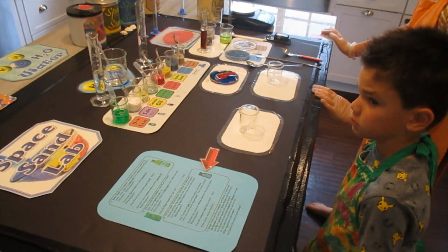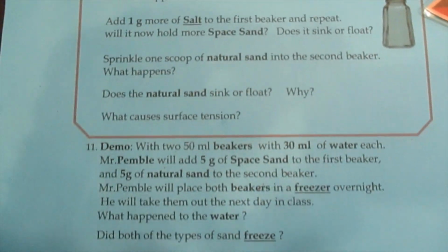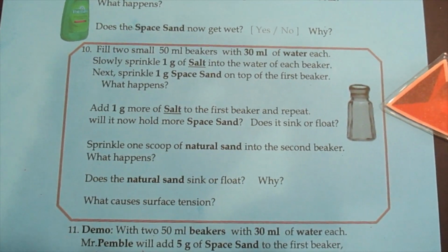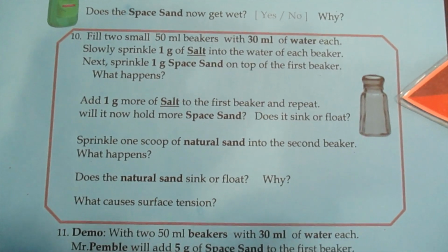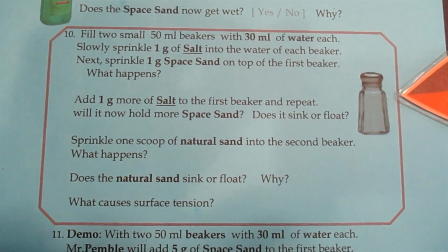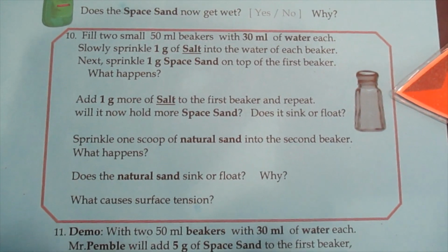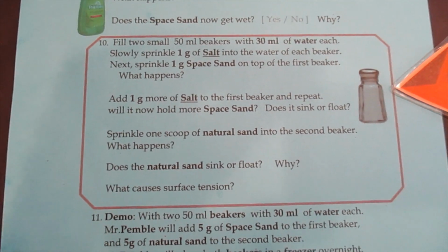Right. Okay, so now we are going to do experiment 10 and 11, the last 2 experiments. Experiment 10 says to fill 2 small 50 milliliter beakers with 30 milliliters of water each. Slowly sprinkle 1 gram of salt into the water in each beaker. Then we're going to sprinkle 1 gram of space sand on top of the first beaker. And that'll be on Ian's side.